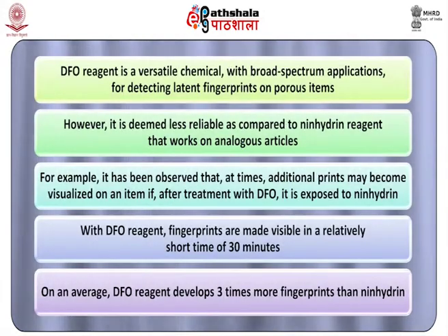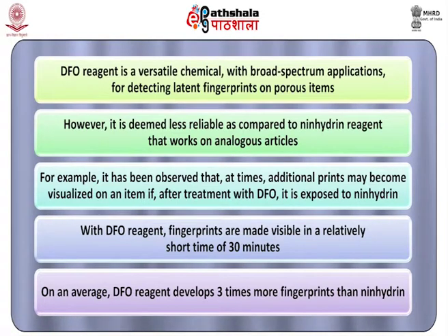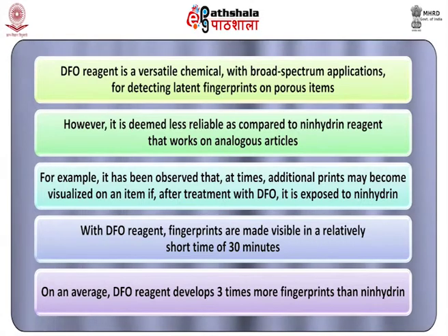Dear students, now let us summarize this chapter. In this chapter, we have learned that DFO reagent is a versatile chemical with broad spectrum applications for detecting latent fingerprints on porous items.